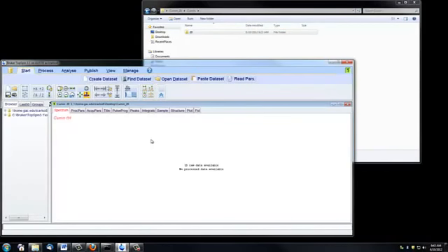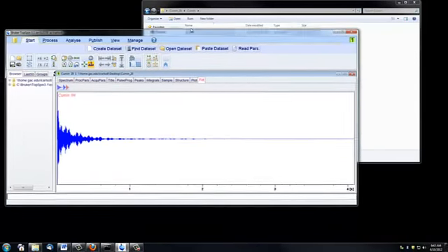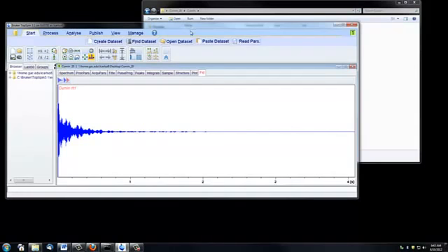You'll notice that it says no process data available, and that's because we haven't actually processed the spectrum yet. But if we click on this FID tab, we'll see the free induction decay pattern, which is the raw, unprocessed form of your data. In order to change this FID into a readable spectrum, I'm going to use the Process Spectrum tab, which is under Process here, and then I click Process Spectrum.